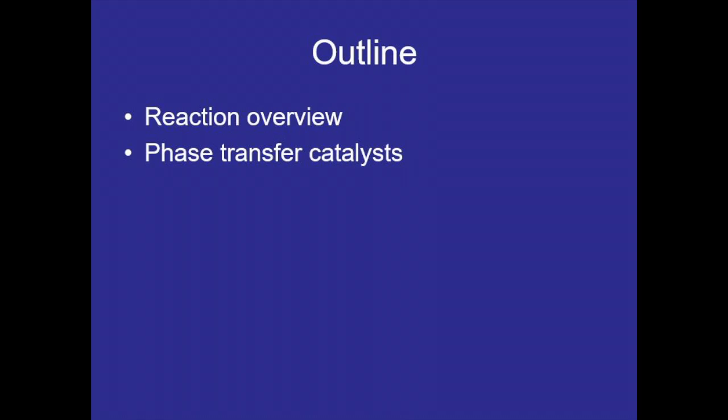Welcome to the Williamson ether synthesis lab. Here's the outline for the video. I'll be going over the reaction and the procedure and talking about the safety concerns for one of the reagents in this reaction. And then I'll go over phase transfer catalyst for a little bit and show the experiment in the lab. Here's the reaction that we'll be doing.